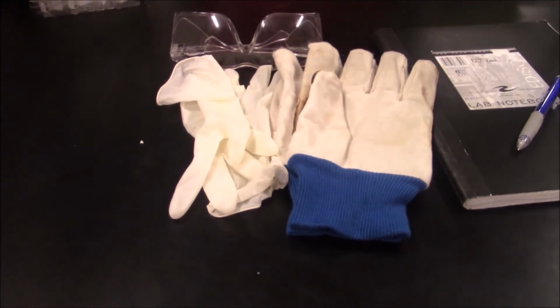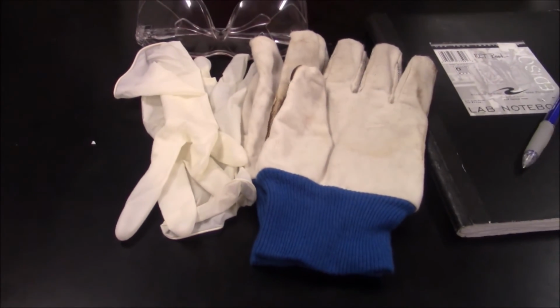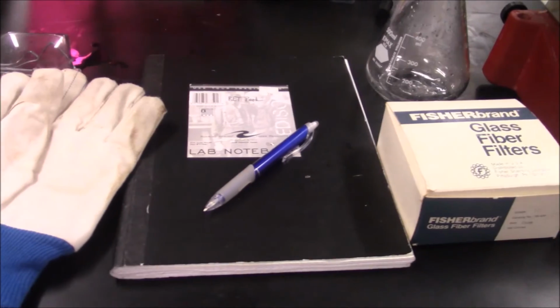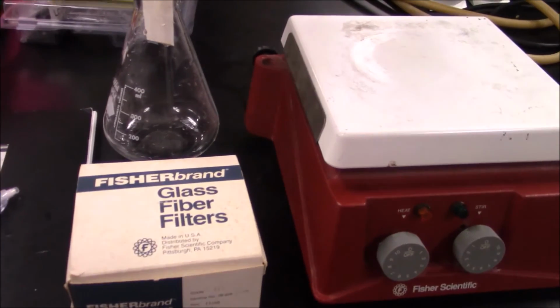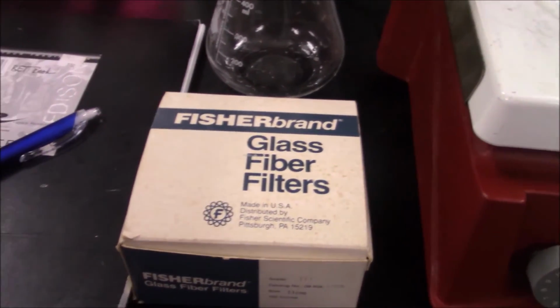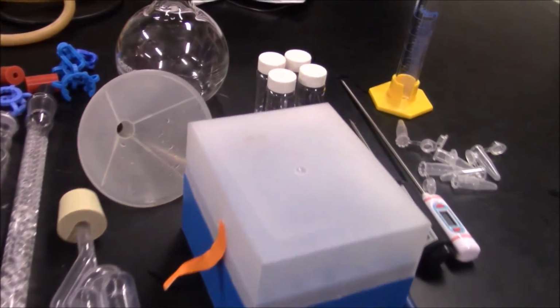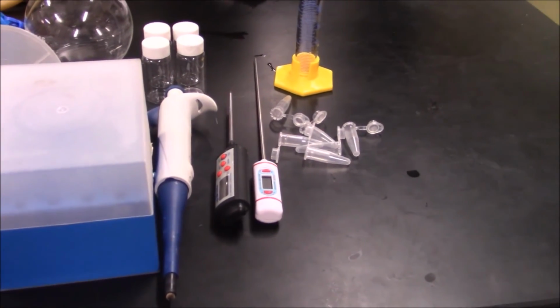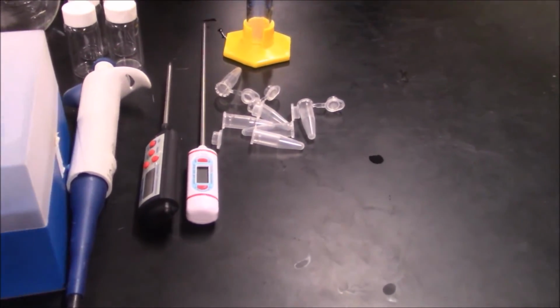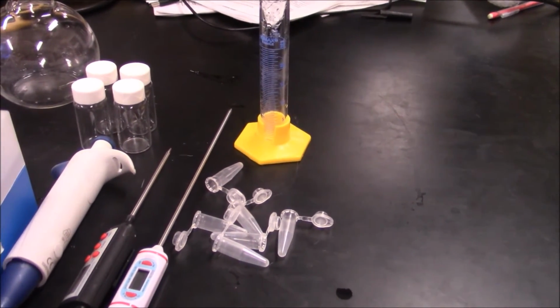For the second stage of this experiment, you will need the following pieces of equipment: safety goggles, rubber gloves, heat-resistant gloves, a lab notebook, a pencil, a scale, a Buchner funnel, 110 millimeter filter paper, a Buchner flask, a sink suction device, a hot plate, a distillation kit, a funnel, a 500 milliliter flat bottom flask, the 100 to 1000 microliter pipette tips, 4 20 milliliter vials, 2 digital thermometers, a 20 milliliter graduated cylinder, and 1 milliliter plastic centrifuge tubes.